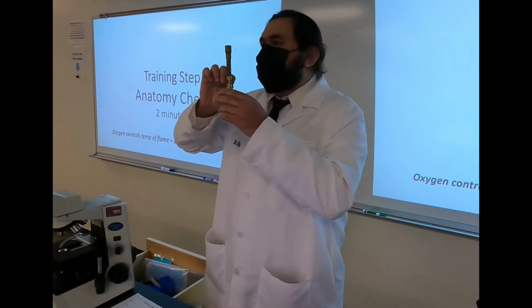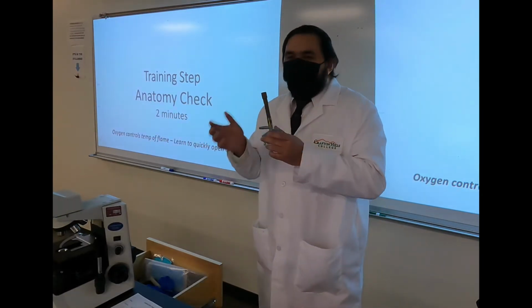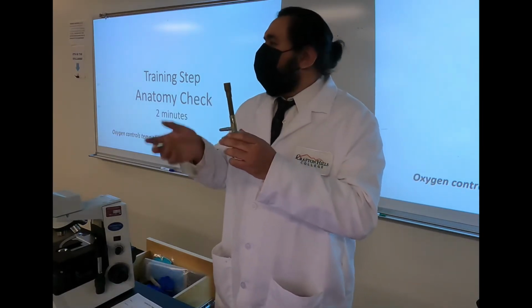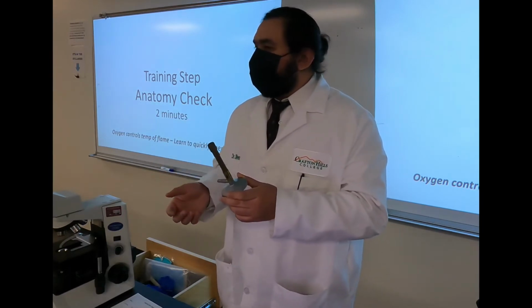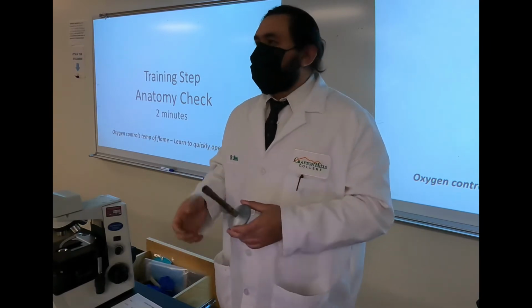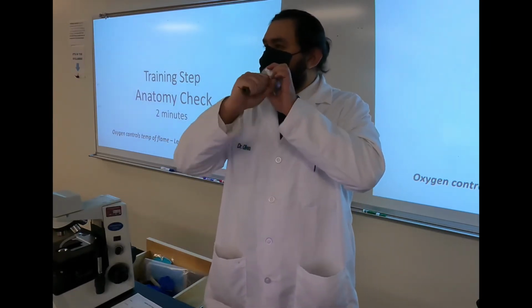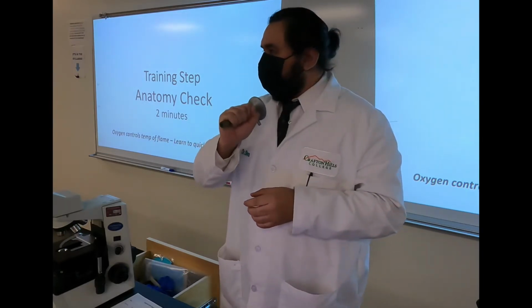Right below, at the base of the barrel connected to it, is the oxygen intake. I know air is going in it, but in reality we're measuring oxygen. That guy will turn clockwise and counterclockwise to make sure you're getting the right amount of oxygen. It should always be closed at the beginning and always be closed at the end, meaning you should be able to tighten it clockwise until it can't go any further. That's how it starts, that's how it ends.